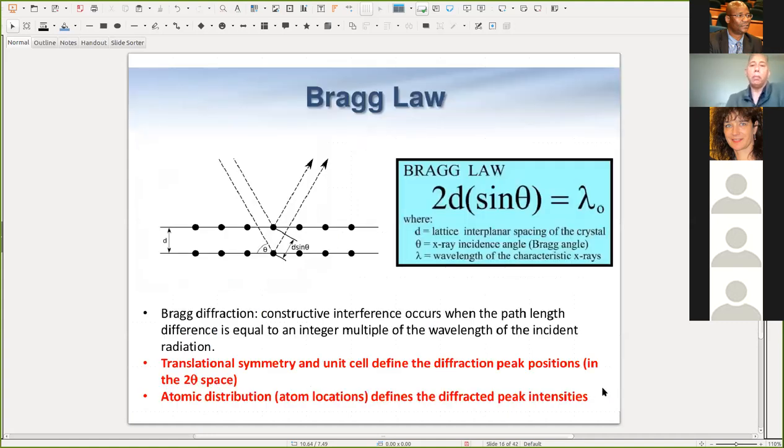Okay, so a lot of you are familiar with Bragg's law: lambda is 2d sine theta. I'll just zoom through it in one second. Basically, the main point is if you imagine a photon reflecting from a row of atoms here, you get a certain reflective amplitude. And if you reflect from the row below it, you work out the phase, the extra path length that ray would have to go. This is not exactly how you're supposed to do it, but it's very conceptual and it gives you the right answer. If lambda is 2d sine theta, then the reflections from this layer and this layer add in phase. And if everything adds in phase, you get a strong intensity, and that's your Bragg peak. So this is the traditional thing.